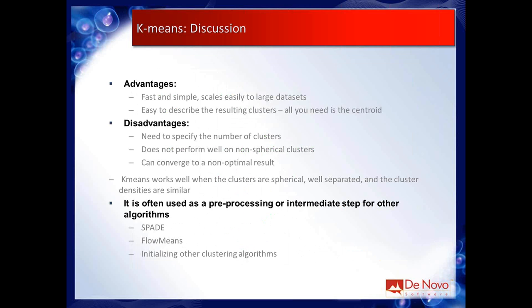And it can also converge to a non-optimal result. Similar problem to tSNE actually. K-means is also generally randomly initialized, and it's also minimizing something. It's minimizing the distance of all the points to the centroids. So you've got this random element and the minimization element.